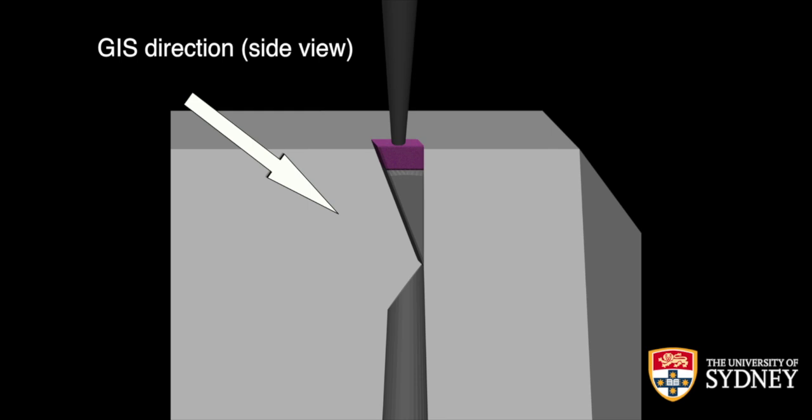If you have platinum, which is what a lot of people have on their machine, so again, it's trimethyl platinum, a lot of carbon in there, then the geometry constraints are not as bad because it sticks very well to everything, and it's not that often gas limited. It still can be, and it is pretty often, but not as often as, for example, tungsten hexacarbonyl, which is another pretty popular one.